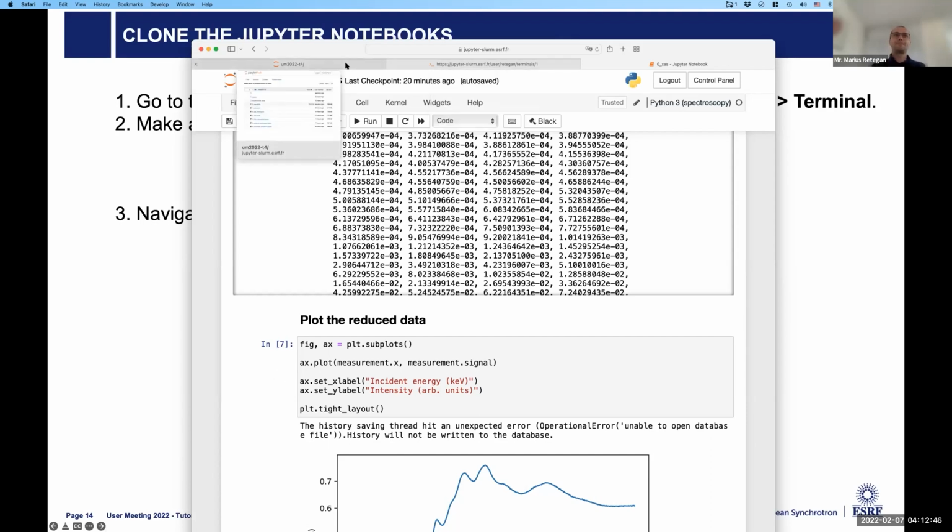But there's still the issue of reading the data format in the program, because as Dimitri says, usually we have ASCII files. Not even 2-column or 3-column format, but this multi-column format from Hamburg or whatever, where we first have to decide where the counter is, where the monitor is, and where the energy is. But these are decisions that you have to make in any case, correct? Yes.